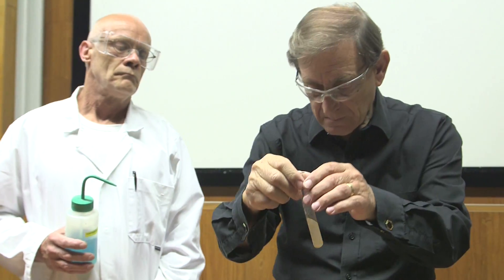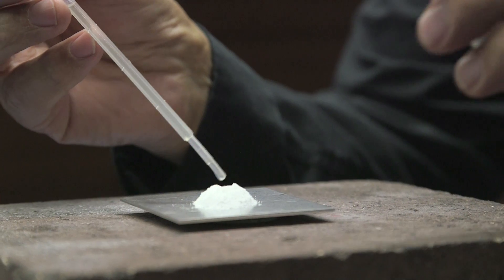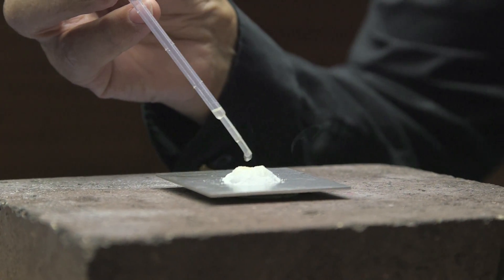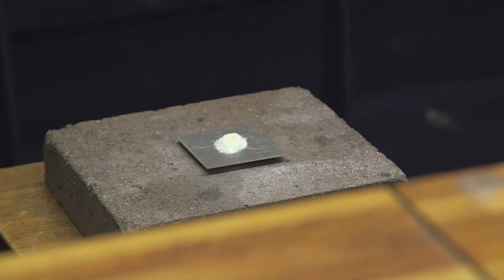The experiment itself is really quite interesting. It's the reaction of white phosphorus — the very reactive form of phosphorus — with potassium chlorate. It is fantastically dangerous to mix white phosphorus with potassium chlorate. But Jim has a special method of doing it which is safe. Even with Jim's method, once the chemicals are mixed, quite often they explode spontaneously. Otherwise, you need something warm to set it off. People say you can set it off with the warmth of your finger, but if you did that, you would no longer have a finger.